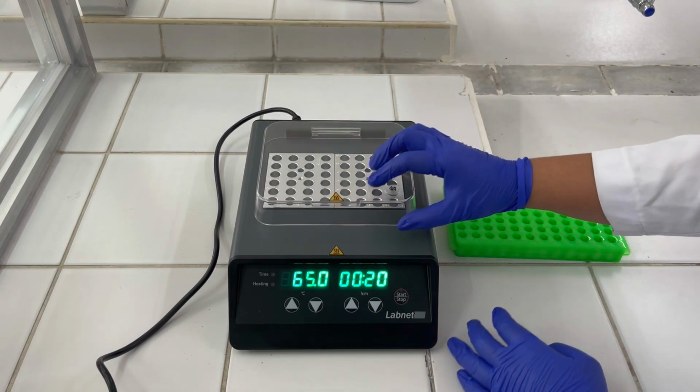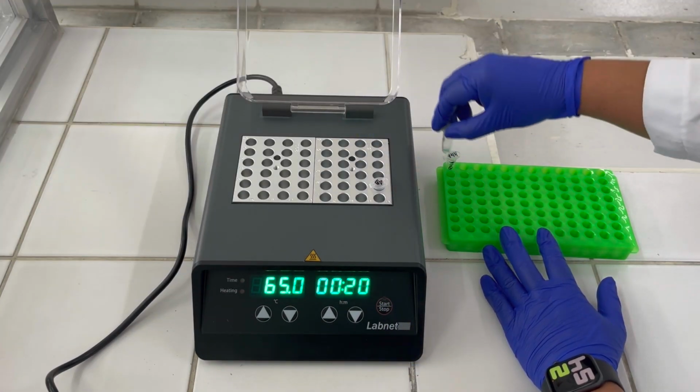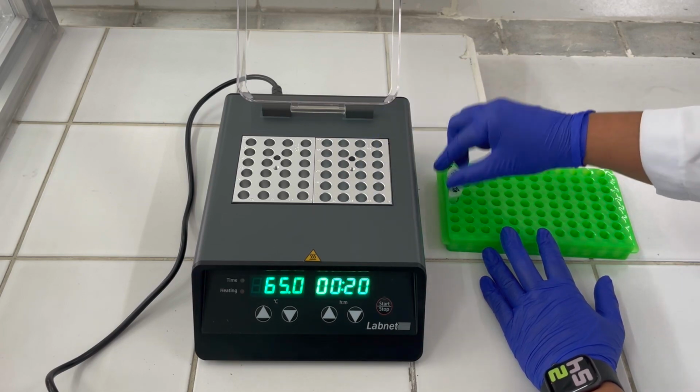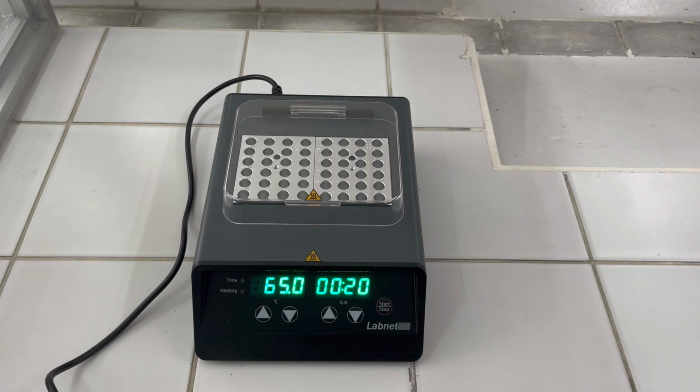You may shake the tube occasionally every 5 minutes. This will help expedite the enzyme treatment. At the end of the incubation, the solution should be clear, or extend the incubation time.